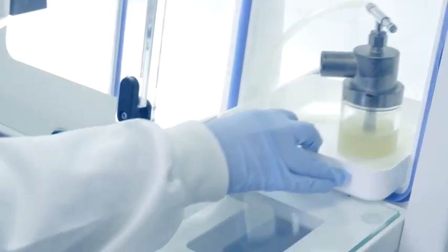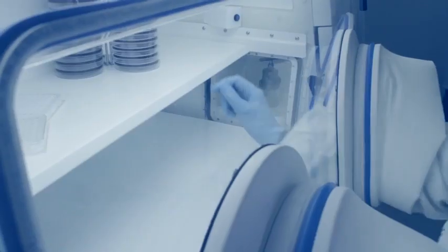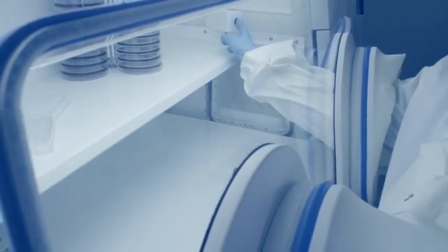We conducted laboratory tests to challenge these filters with high concentrations of aerosolized bacteria and quantify the release of these bacteria through the valves. For testing purposes only, we used a standard H35 workstation without internal HEPA filtration so that bacteria could not be removed from the internal atmosphere before it was discharged through the valves. We prepared a dense bacterial suspension and aerosolized this into the chamber atmosphere using a nebulizer. For this test, the inner interlock door was left open so that bacteria could enter the interlock.